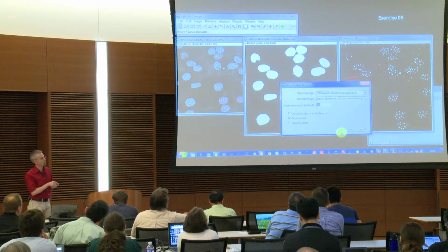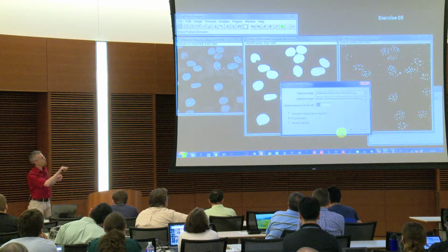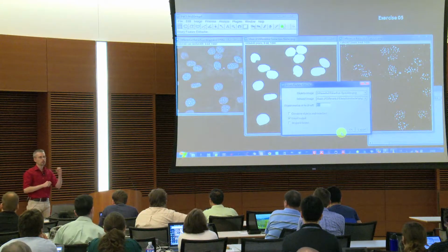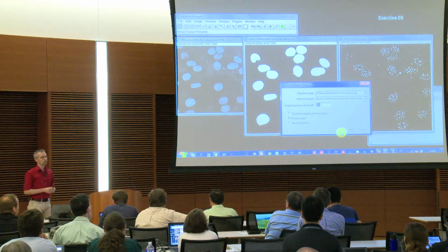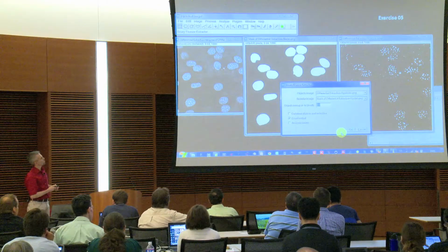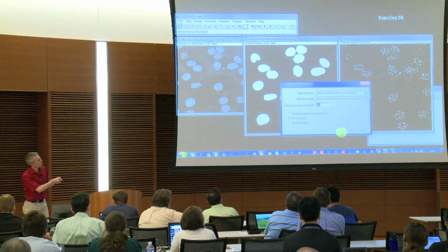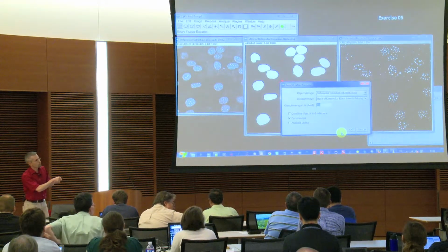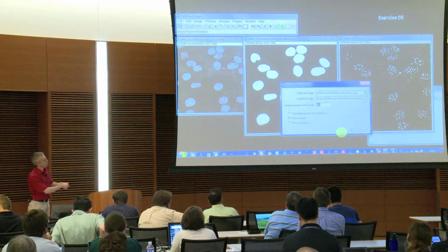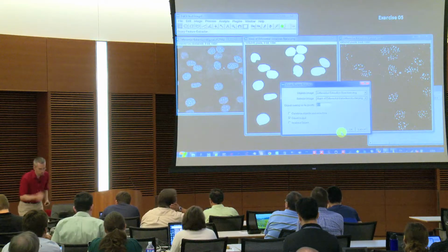I could use 100%, but since the extraction of those ones might not be perfect and some spots might have a pixel outside, I go a little bit lower, so that I'm sure that I have everything which is inside. This was a little bit confusing, sorry. So basically if you have a particle which is lying at the corner here and this corner is not extracted perfectly, then it's not completely inside, but you want to count it. So I'm not going to 100%, otherwise I would exclude that.